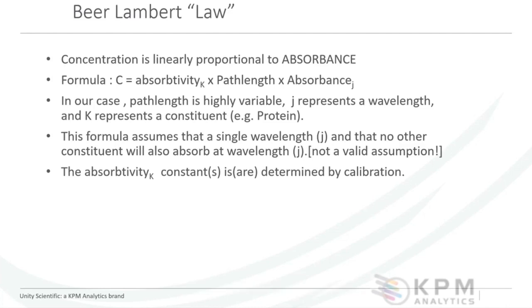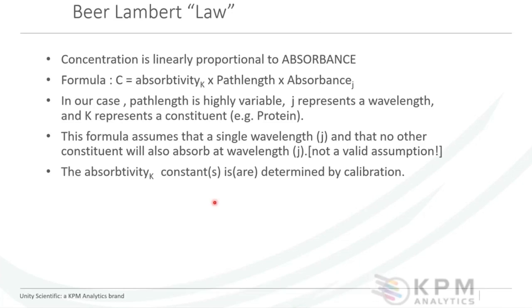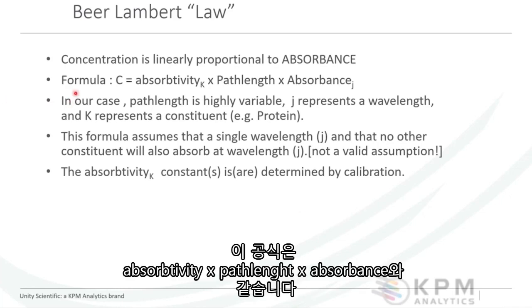There's a law, a principle that's out there, the Beer-Lambert law, that says concentration is linearly proportional to absorbance. This is a theory. There are tons of papers out there that describe slight deviations from this, but it's a principle. In general, the formula looks like concentration equals absorptivity times the path length times absorbance.